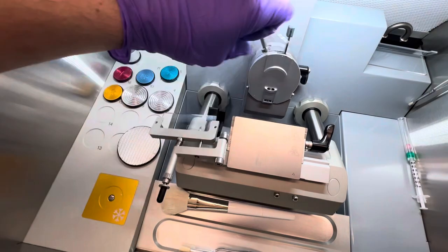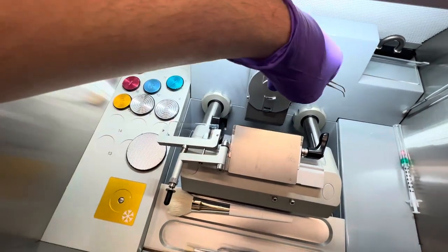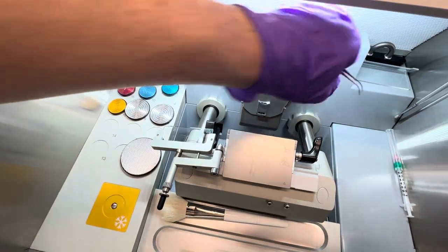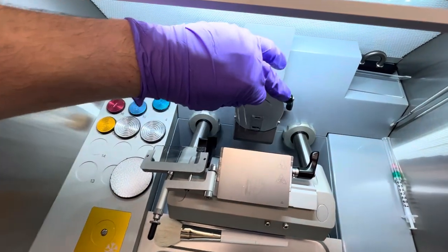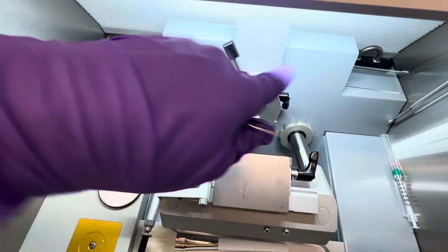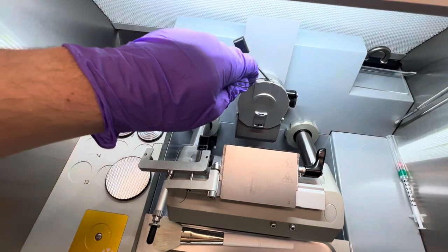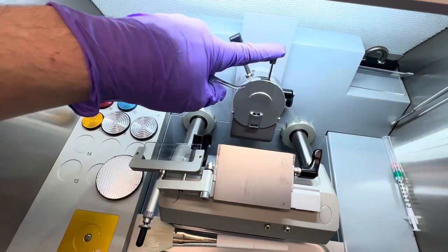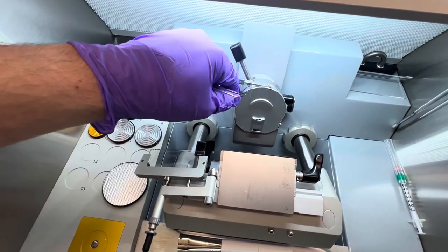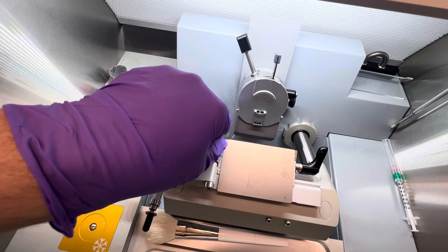You want that secure. Again, you want this clamp down so that the actual specimen doesn't move. And you also want to make sure the specimen head is secure too. But if it feels like it's not moving on its own, then don't even mess with it. These are just the things you want to check when troubleshooting, before you assume that something's wrong with the actual block, which can be a thing if you didn't freeze it properly.